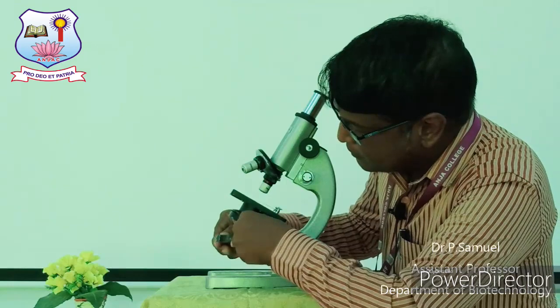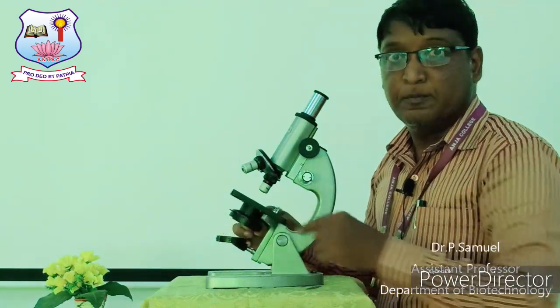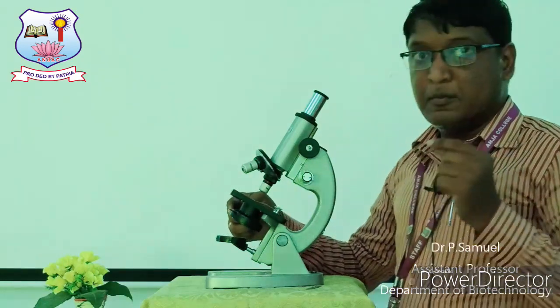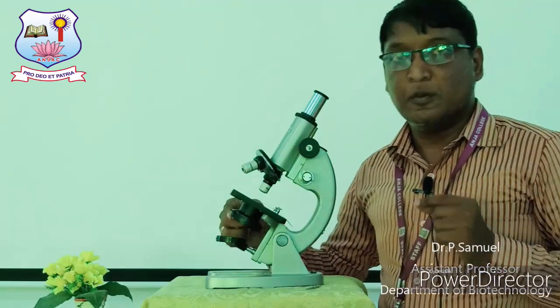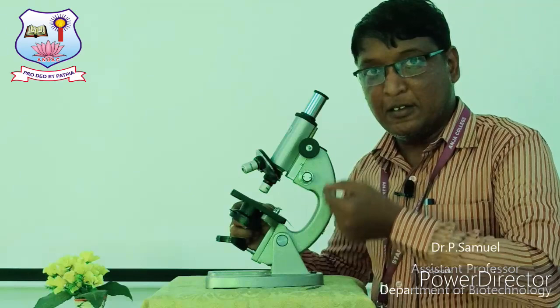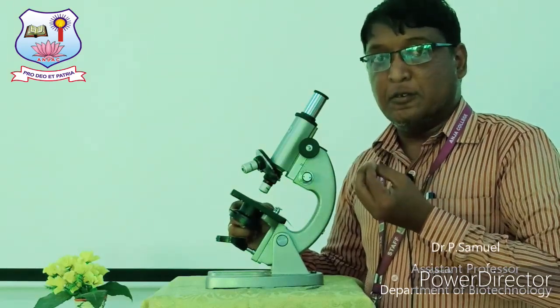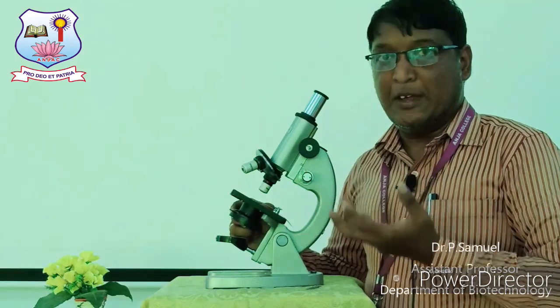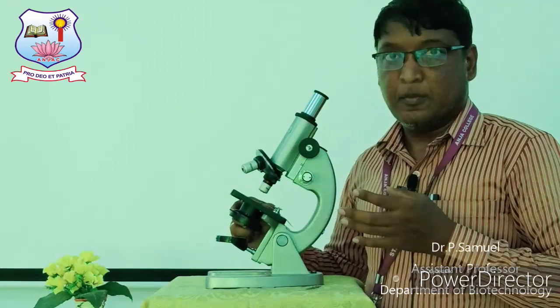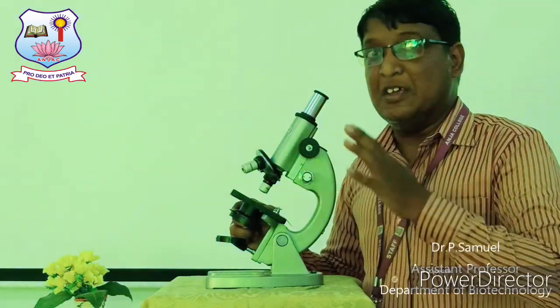Over the mirror there is a small portion. This is called the diaphragm, right? The diaphragm is the heart of the microscope because it controls the amount of light entering the microscope, because overexposure to light may cause blurring of the image. You cannot visualize the image clearly.